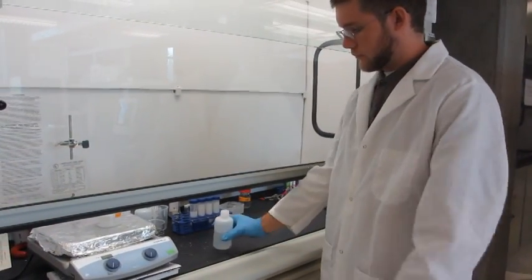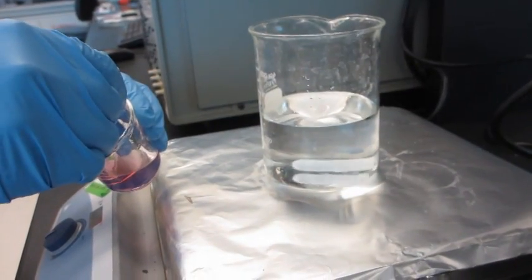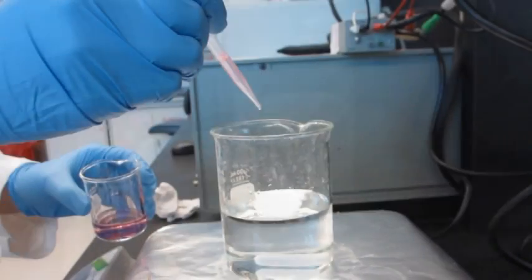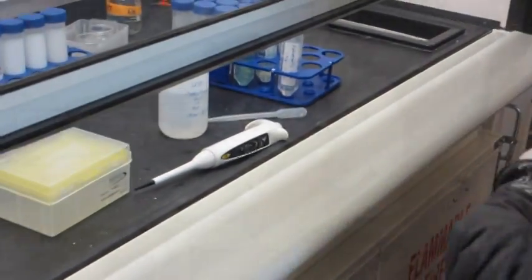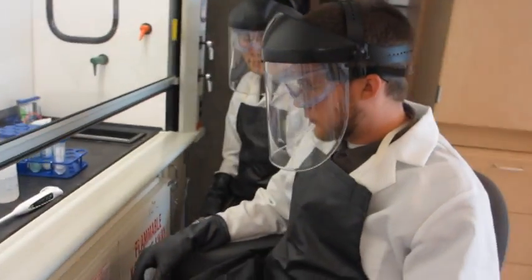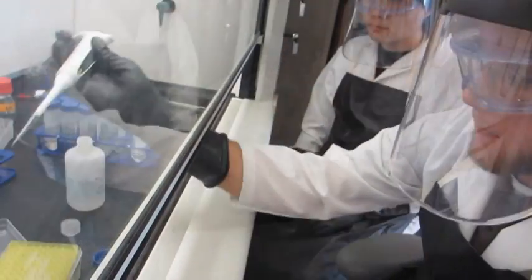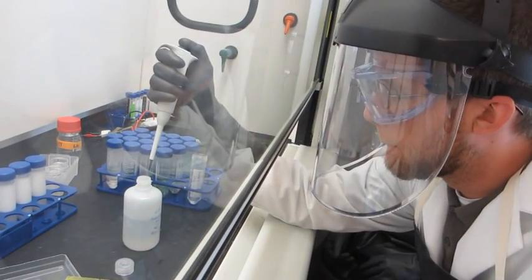Prepare your supplies and equipment ahead of time and always work in a fume hood. Whenever possible, practice a dry run with a less hazardous chemical or water in your experiment. When you're ready to begin, make sure to measure the amount of chemical that is under the permissible exposure limit. Remember to dilute acids by adding acid to water, never the reverse, to avoid the potential to cause splattering. All corrosives should be mixed slowly.